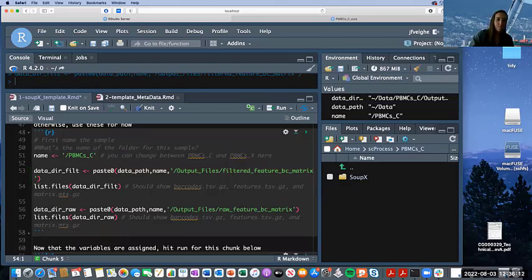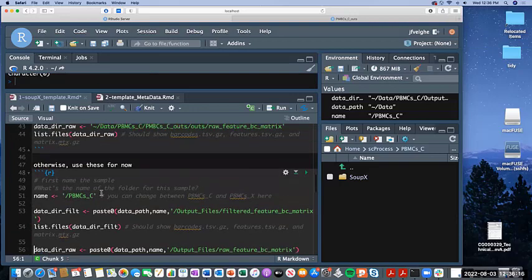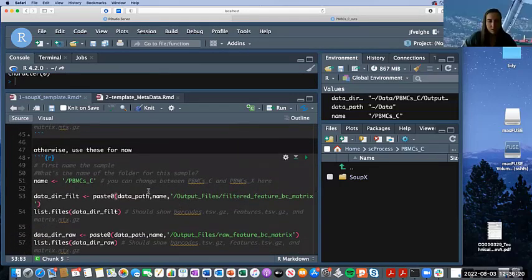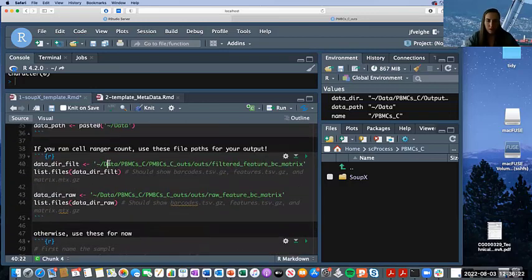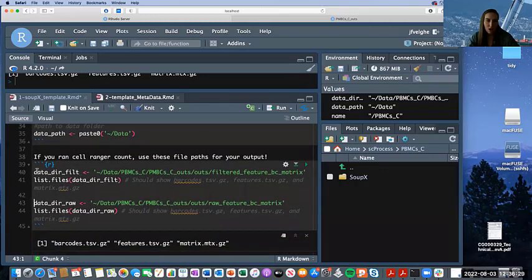Character 0. For list files, when I tried running it. Oh, I am too. Yeah. I am as well. Let me check up here first. Okay, so that one's working.